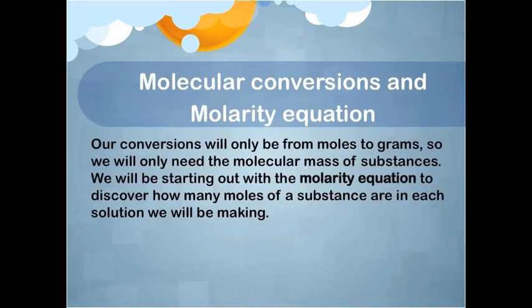In this particular lab, we will only need to convert from moles to grams or vice versa. We will also need to know the molarity equation for some of the calculations performed in lab. The molarity equation is molarity equals moles of solute divided by liters of solution. To convert from grams to moles, we need to know the molecular mass of the metallic salts, which can be found on the periodic table.